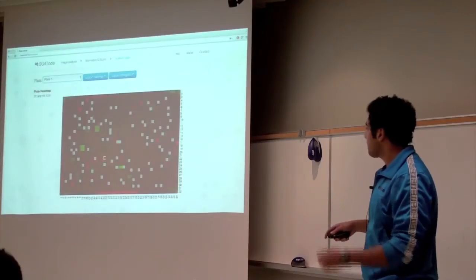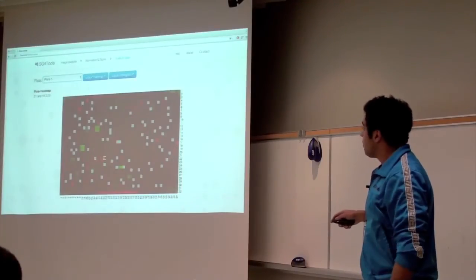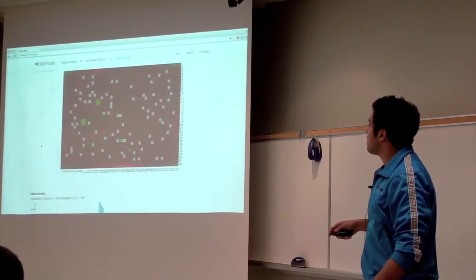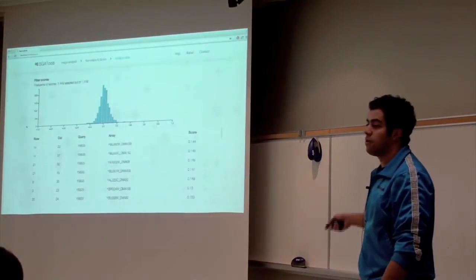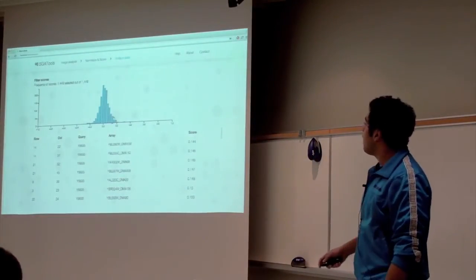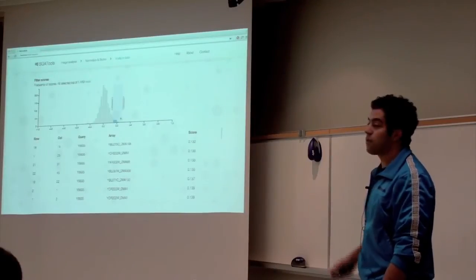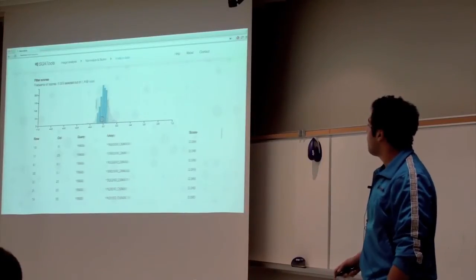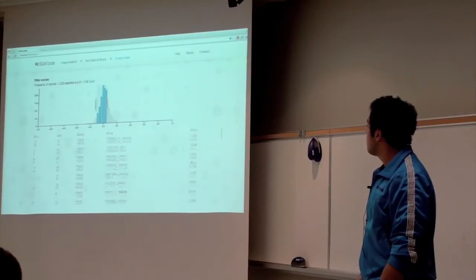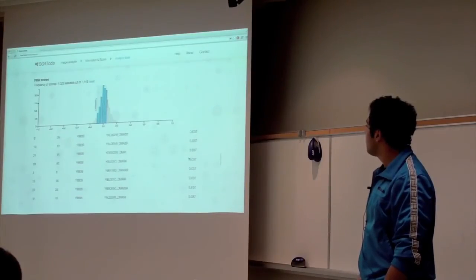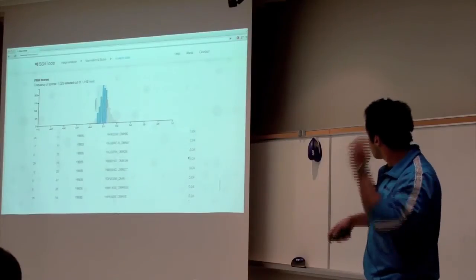You can also scroll all the way down and you'll have a histogram of the scores that you got back. Typically, it's a normally distributed histogram. You can drag along specific windows of the histogram, have a look at the extremes of the histogram, which is typically returned in the table.